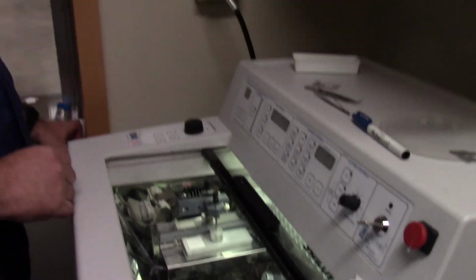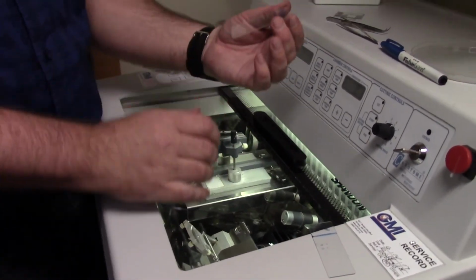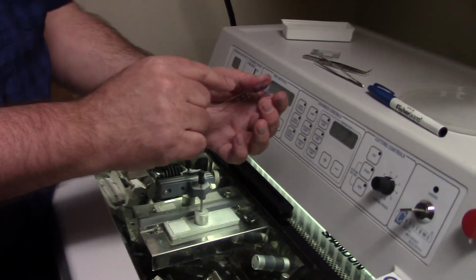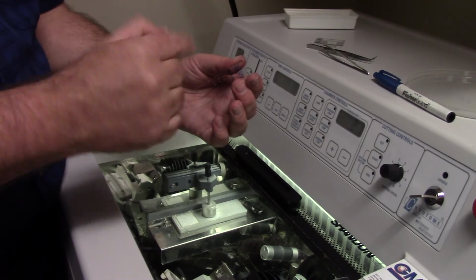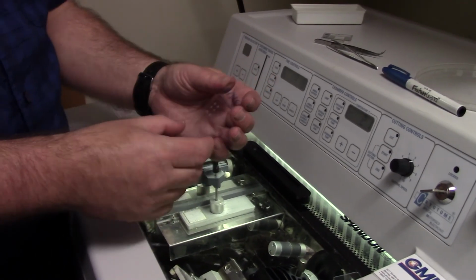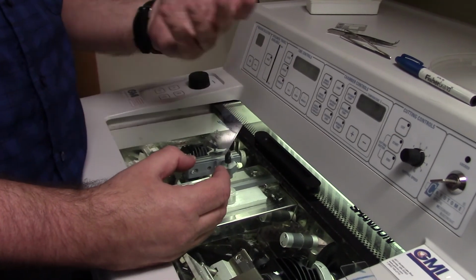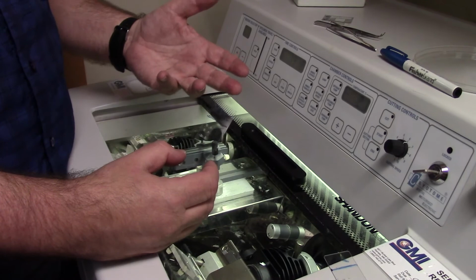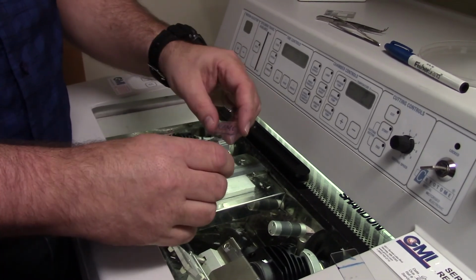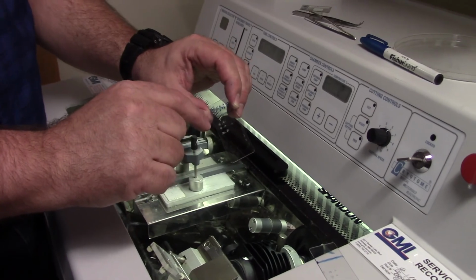So we'll just continue to fill this up until the slides have tissue all the way along their length. We'll make 2 rows of tissue, and then we can stain these with our antibody, comparing regenerating limbs to normal limbs, stump limbs, to see, is our antibody expressed in all muscle or only in regenerating muscle? Or is our antibody finding its target expressed only in neurons or only in the blastema? Which would mean it would be found in our smaller tissue section but not our larger one.